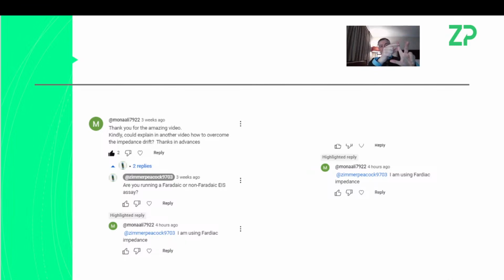If you've modified those electrodes, that is a definite source of drift. And then the underlying electrodes, things like carbon are quite inert. Gold and platinum are actually a bit more active than some people realize. So the answer is, without detail, I can't really know what the source of drift is. But like I said, I can list at least 3 sources of drift in your Faradaic impedance experiments.